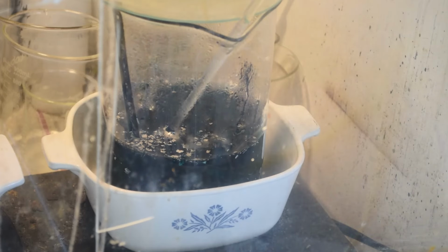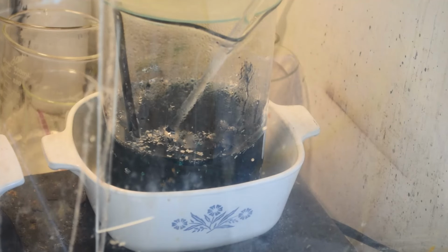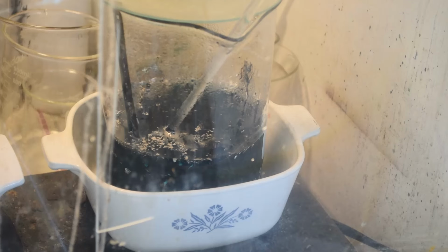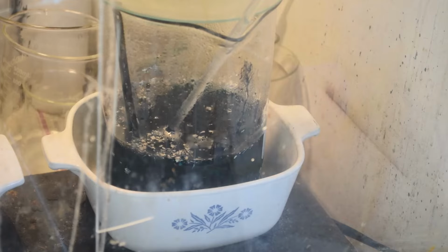Or at the very least, skim some of the foils off and try to dissolve them, and then see if we get a clear palladium signal. That might be the easiest thing to do on a small scale. This is a small scale test after all. Let me see if I can skim some of these off and get them into another beaker and try dissolving them and see what happens.